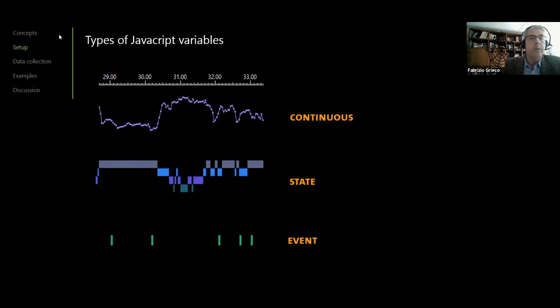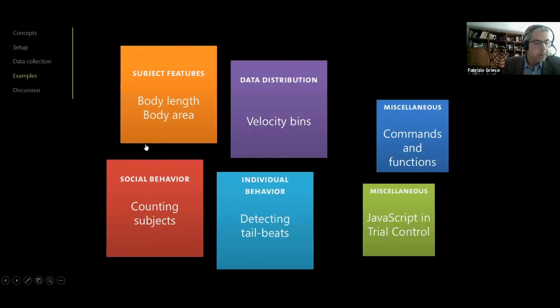So we go to the examples, and let's see. I selected 4 examples here, and the reason is that first reason, I don't want to create overlap between different applications, okay? So for instance, I have one example here about fish and one example here about mice.